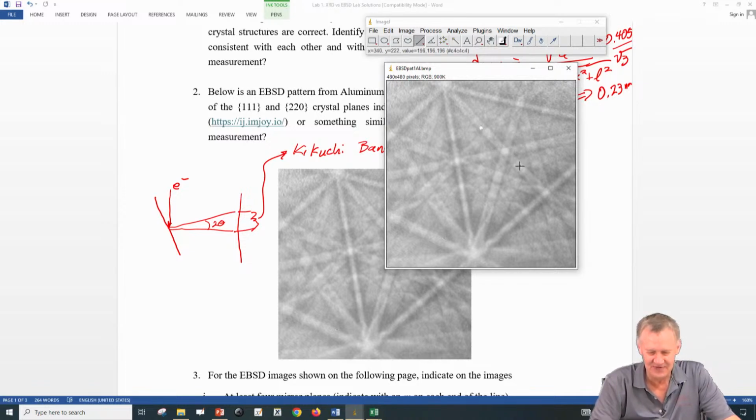Okay. If this is a threefold axis, this has to be the same as this, has to be the same as this, which means that must be a mirror plane, and this must be a mirror plane, and this must be a mirror plane. Does it seem right? Is this a mirror plane? We look at these peaks, yeah, they could be right. These could be the same.